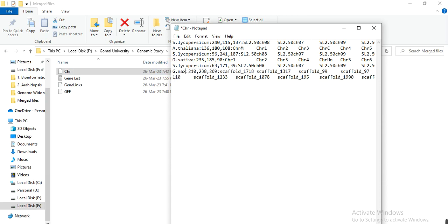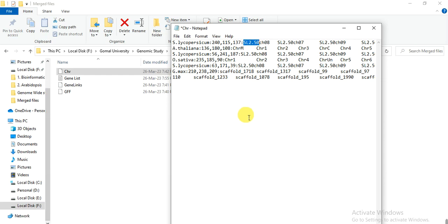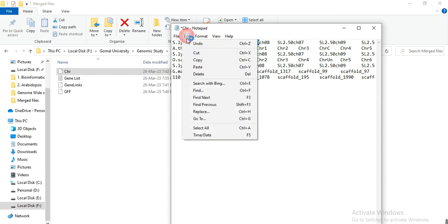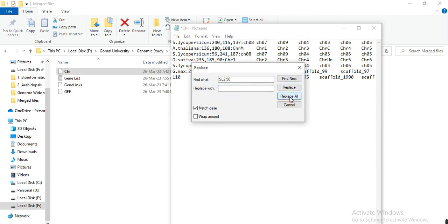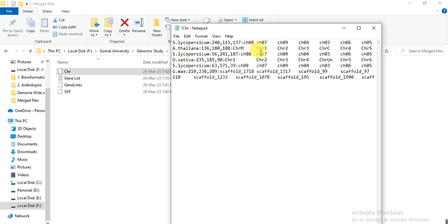Now the chromosome name of Solanum lycopersicum is also long. We need to delete that. I want to delete that SL2.50. So select it, copy. Now go to edit, replace, find what. So here you can paste. Keep the cursor here on replace with. And here you can replace. So in Solanum lycopersicum the name SL2.50 is deleted from that. So we only get this chromosome name. We only want to keep the chromosome number.